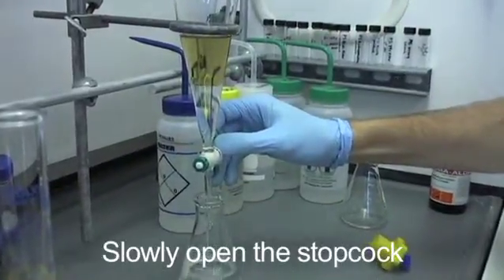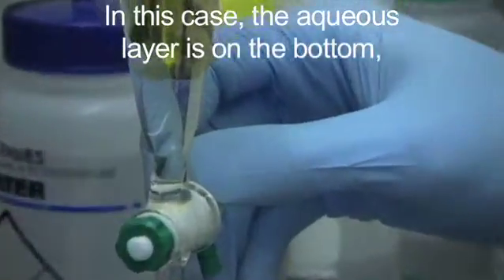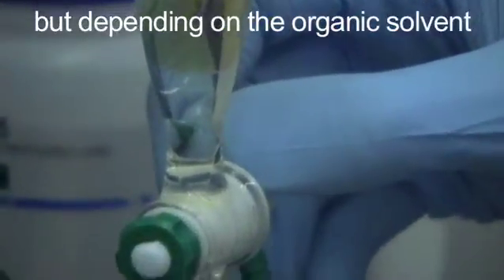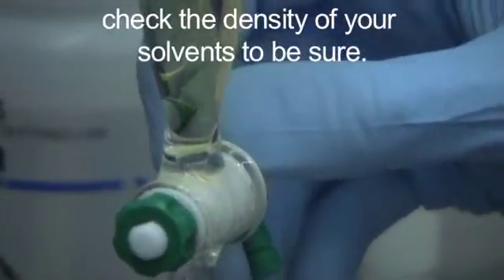Slowly open the stopcock and drain the aqueous layer. In this case the aqueous layer is on the bottom, but depending on the organic solvent, it may be on the top. Check the density of your solvent to be sure.